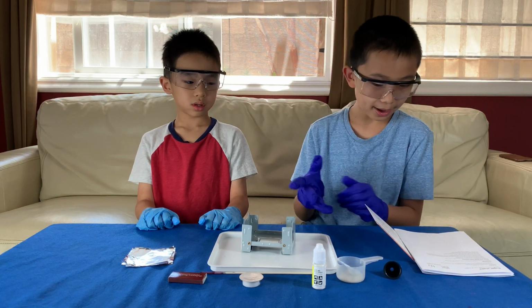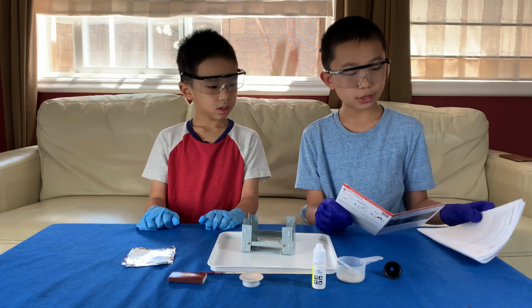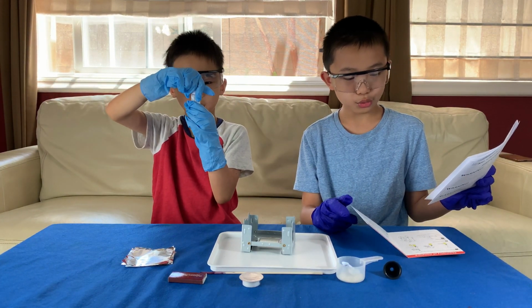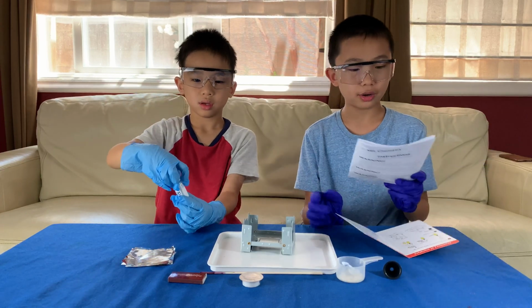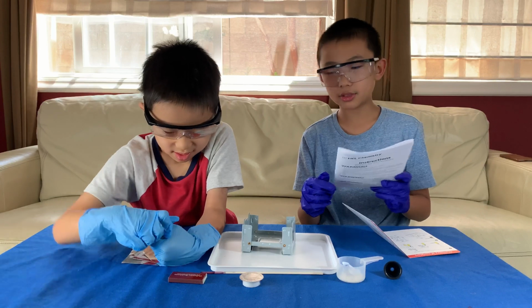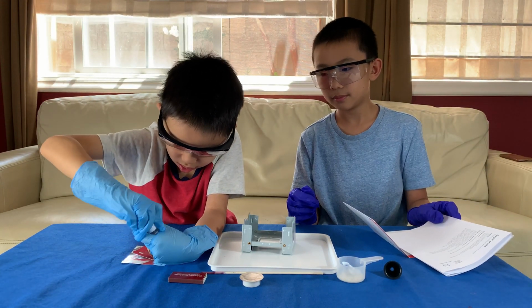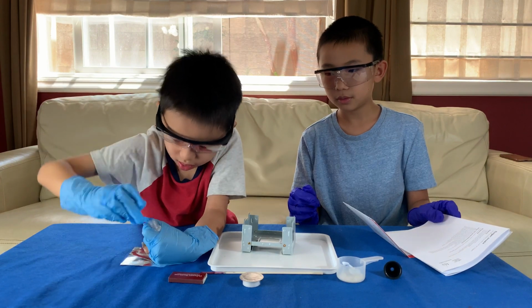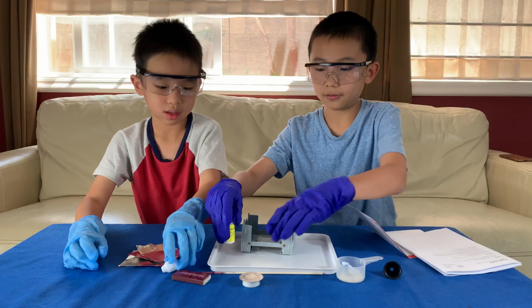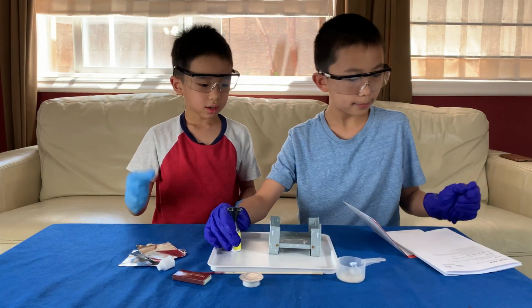Okay, and now it's time to start. So first we prepare a mixture of NaHCO3, which is baking soda, and sugar. So open the bottle of NaHCO3 and insert the funnel into its neck. Be careful. Need my help? Good job. Okay, we're gonna insert a funnel. The small one. Here we go.